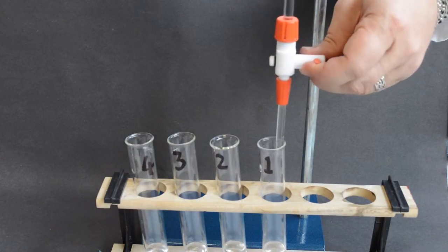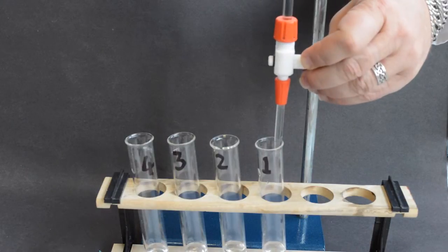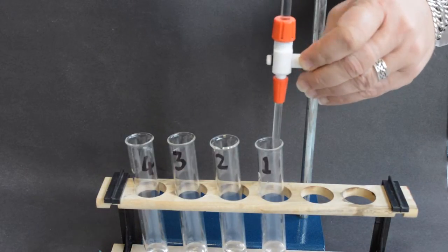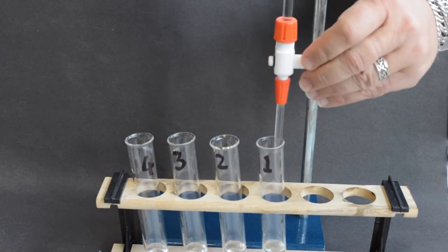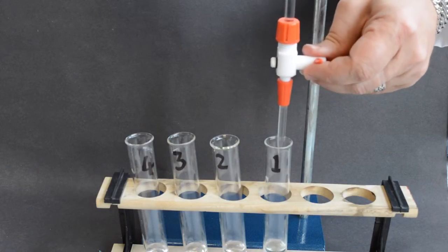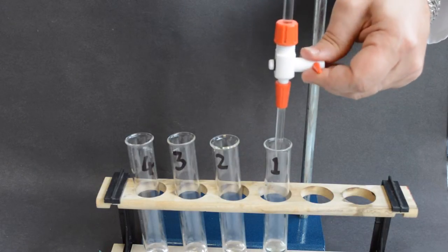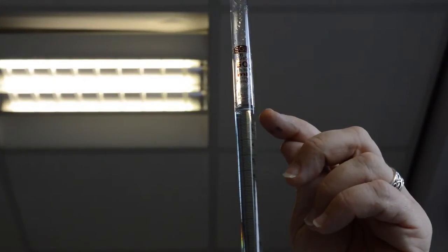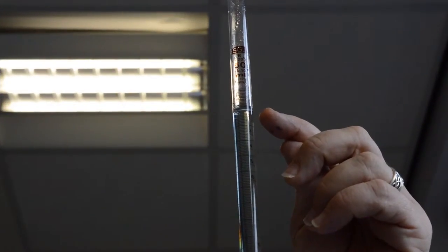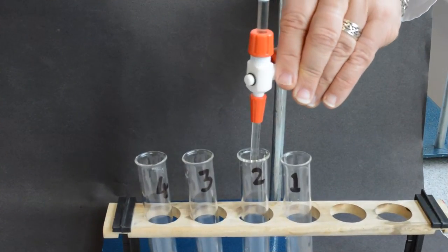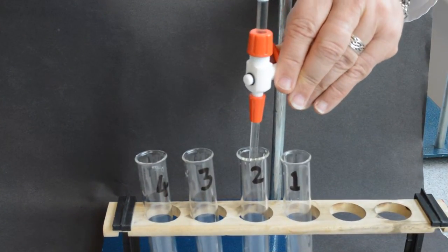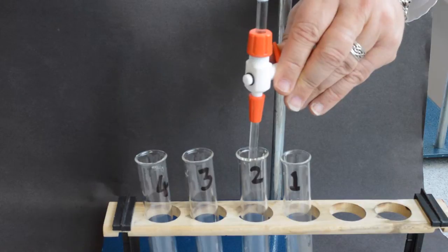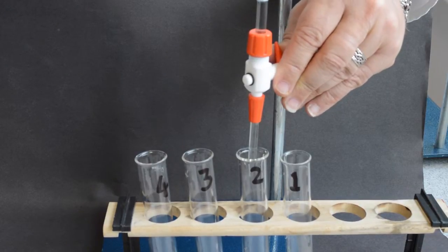Then release one milliliter of copper sulfate into the tube labeled number one. Then note down the value of the volume left in the burette. Repeat this step for tube number two, releasing two milliliters into this tube.